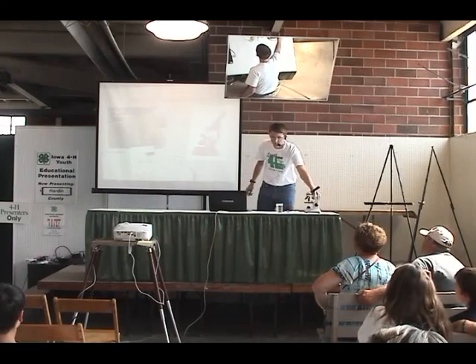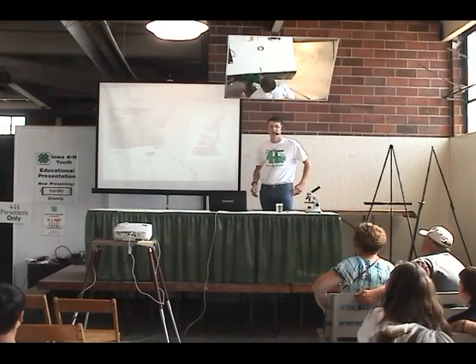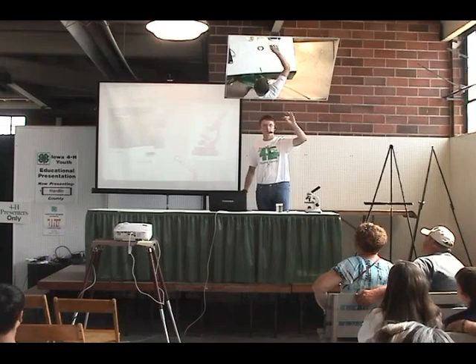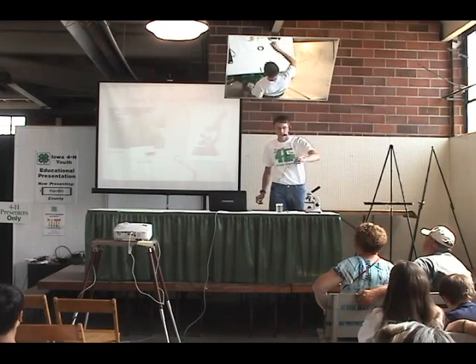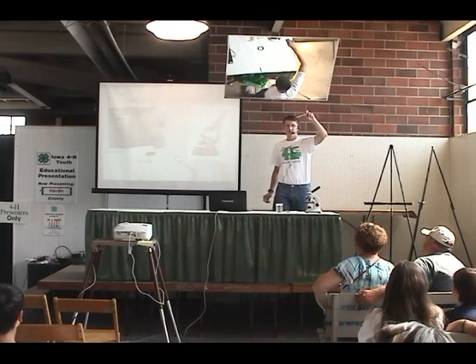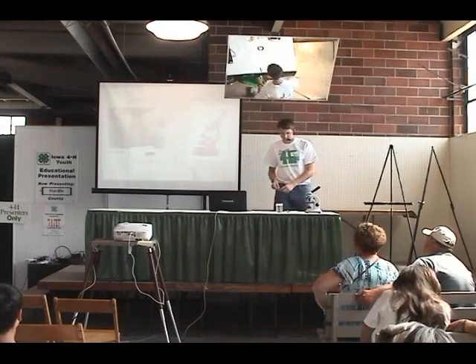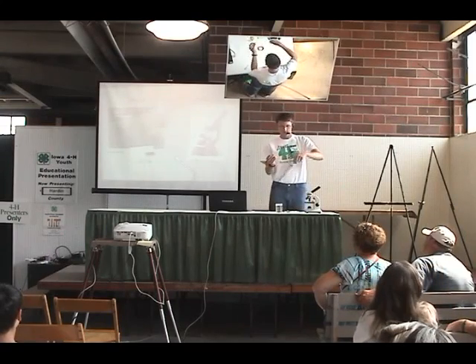You'll need a microscope, like this one, or this one shown here. You can probably get these from a science catalog or hobby store. And you also want slides that come with the microscope. These are just clear rectangles made of glass that you can put your samples on. An eyedropper, like this one, so you can get an adequate size sample. And finally, a jar of some kind that you can hold your water with. And I'll also demonstrate how you can look at these when you're at home.